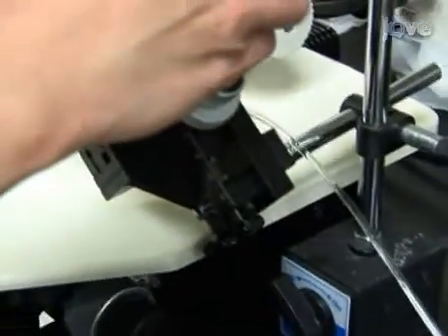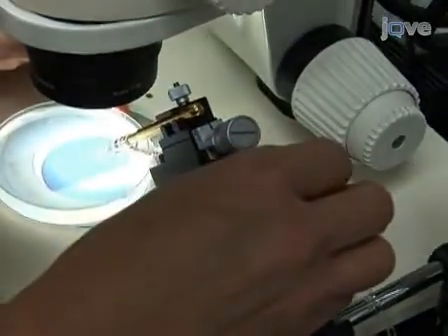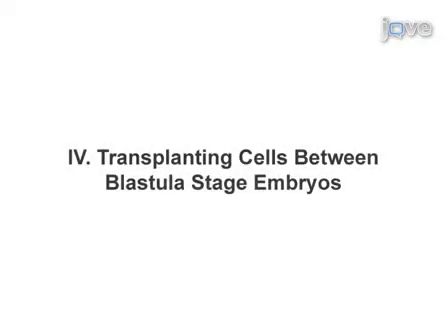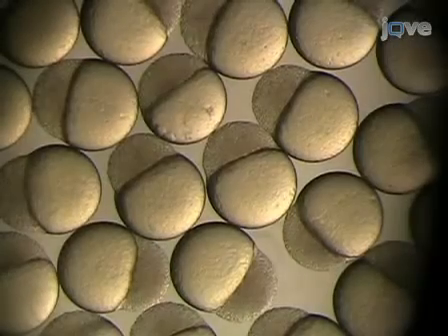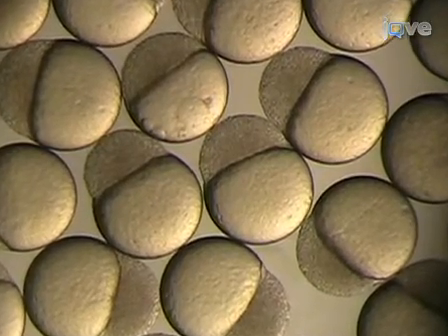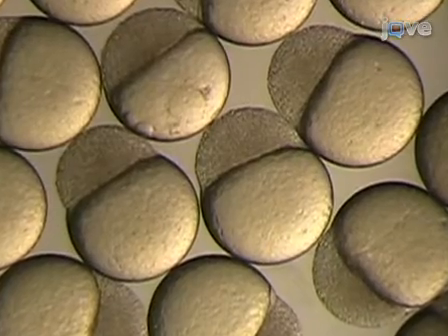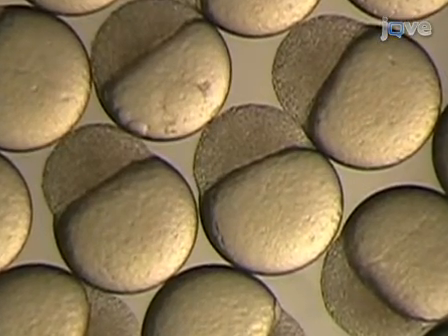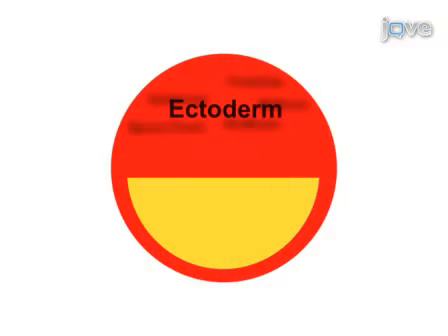With the rig and transplantation needles prepared, you are ready to make chimeric embryos. Blastula transplants are used to transplant cells between embryos when fine fate map information is not required. With the exception of primordial germ cells, most cells are generally not committed to a fate at this stage. The fate map of the blastula is such that we can distinguish between cells that are going to give rise to ectoderm and cells that are going to give rise to mesoderm.